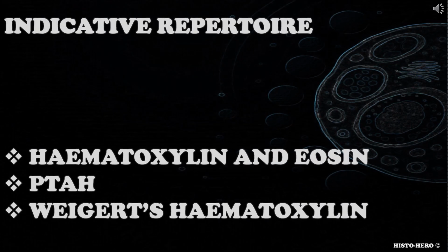The portfolio offers indicative repertoire for this subsection that includes hematoxylin and EOSIN, PTAH or phosphotungstic acid hematoxylin, and Weigert's hematoxylin.